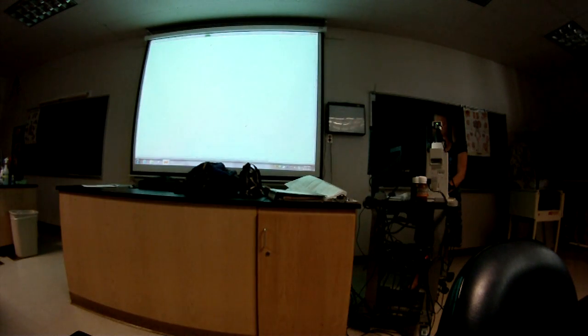Okay, what is that organ was question 7.